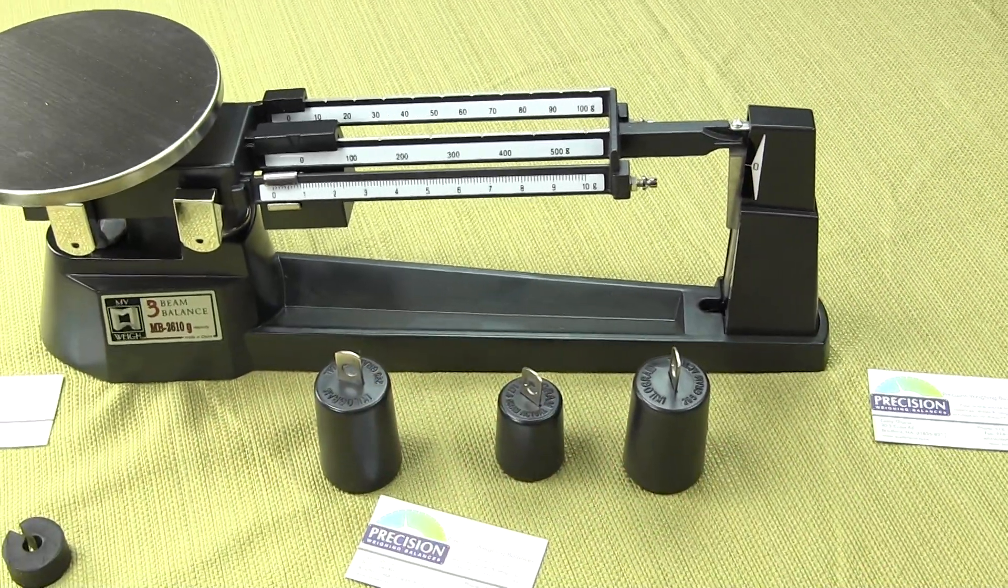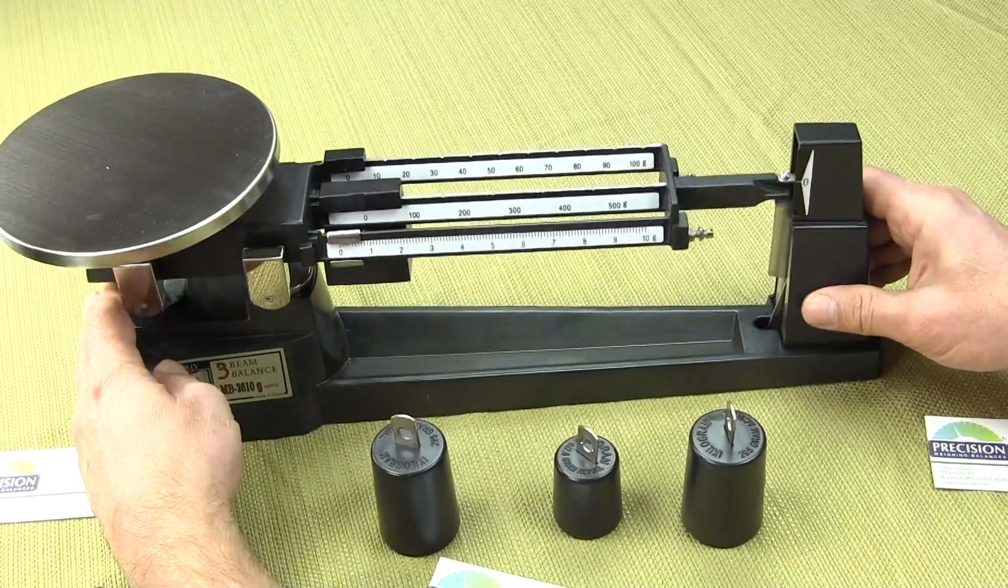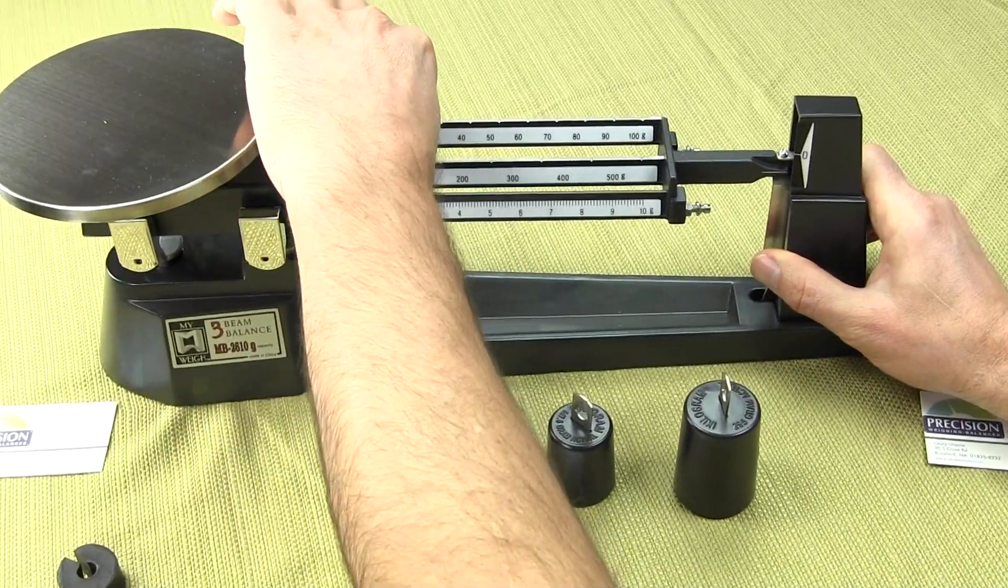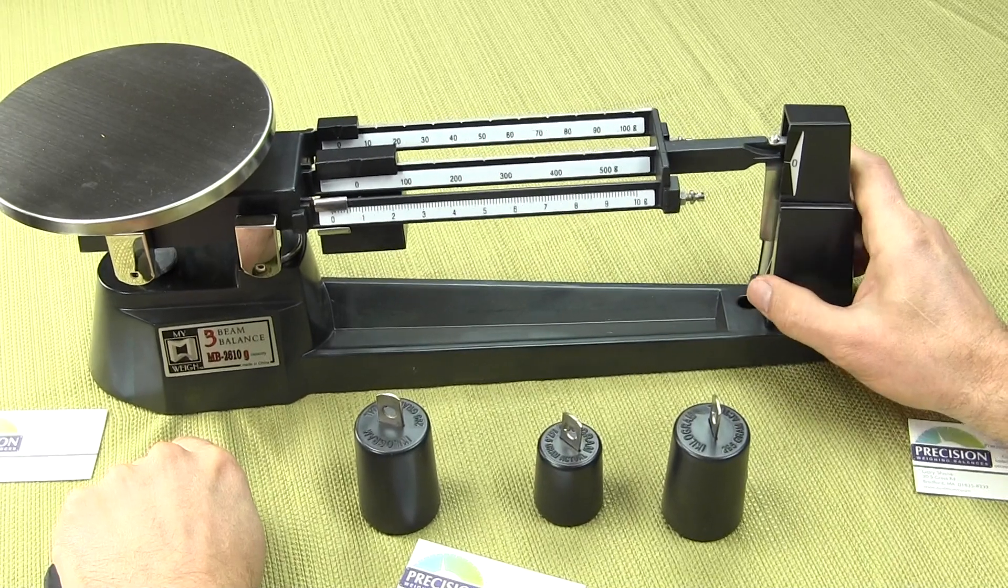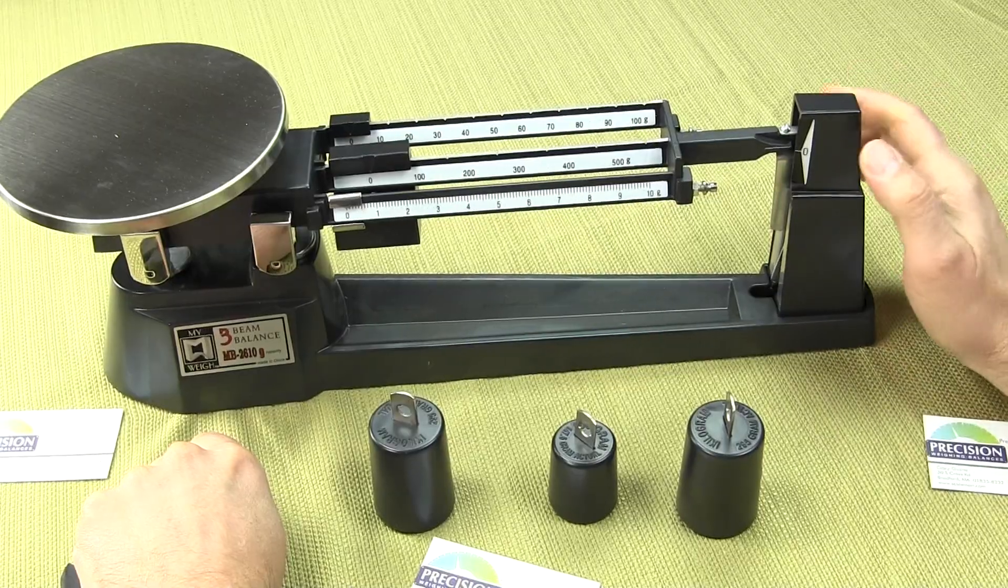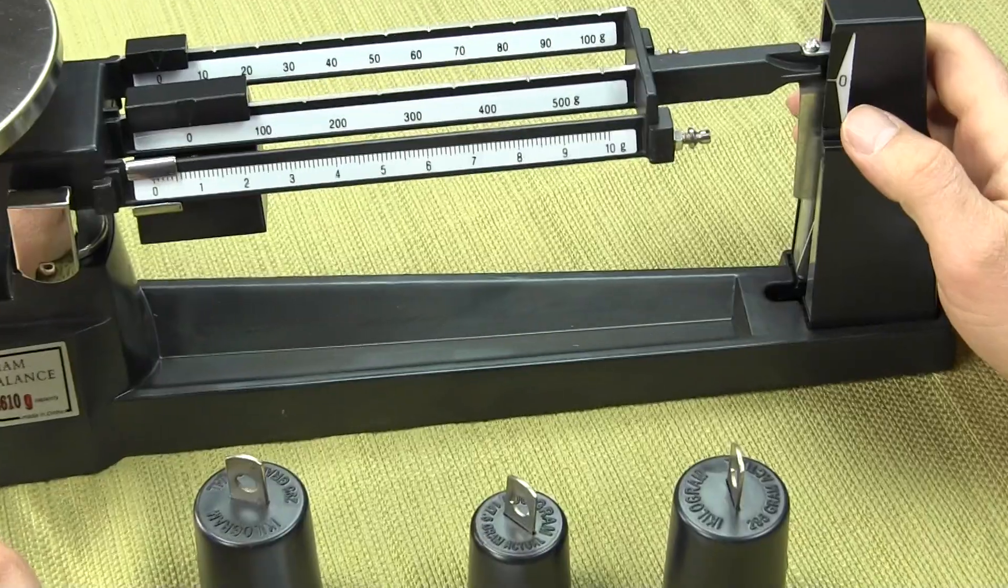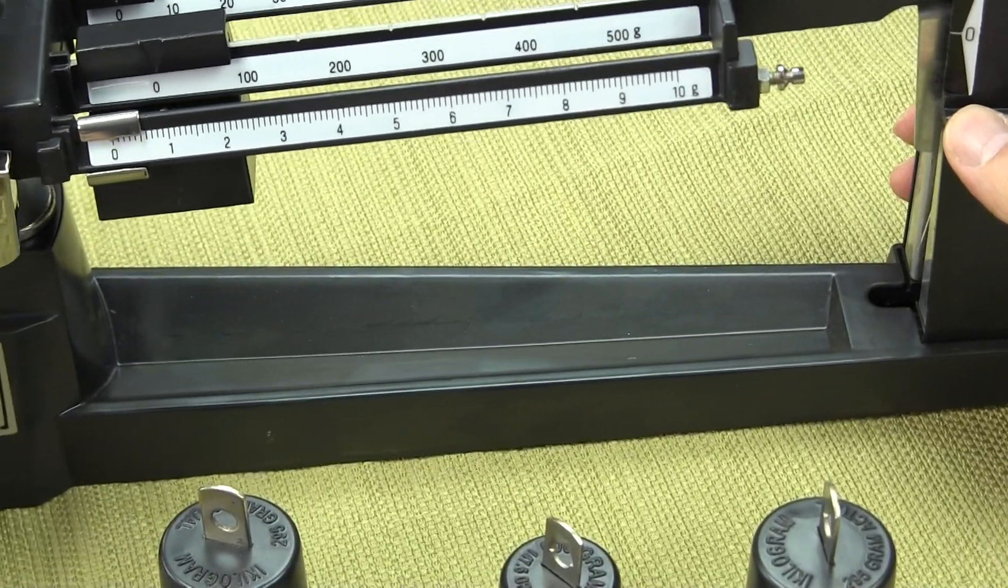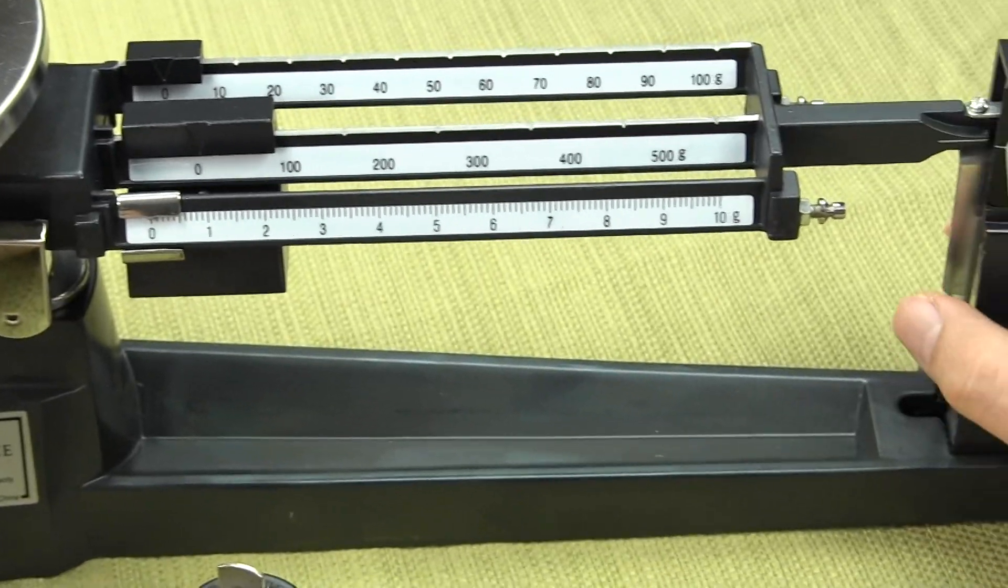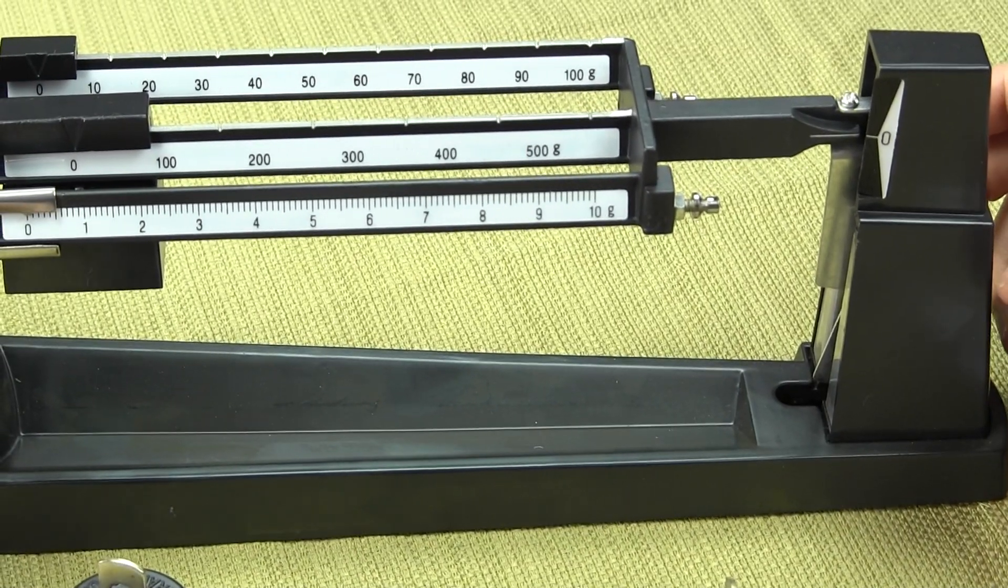The first thing we want to do is adjust the three beam balance so that it's level. We need to make sure that all the poises are all the way back to the left. As the balance oscillates up and down, we're looking here on the right hand side where the hashtag is, and it's a little high right now. We're going to use this curl knob. If we curl it in, the beam will come down. There we have it, it's level.